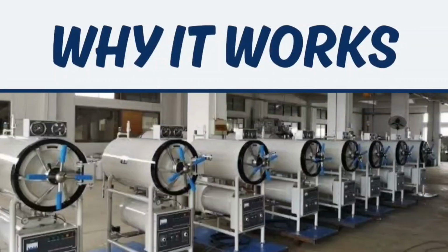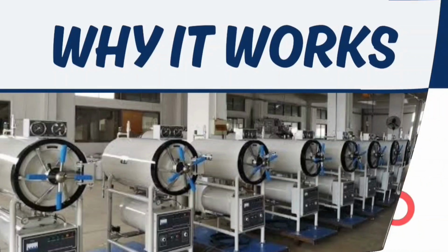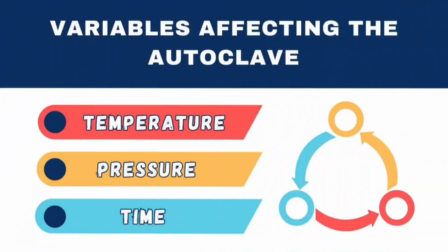After knowing the process, this time, let us understand the way an autoclave works. There are three variables affecting an autoclave: temperature, pressure, and time. As temperature increases, the pressure increases as well, and as temperature increases, the less time it takes for sterilization.